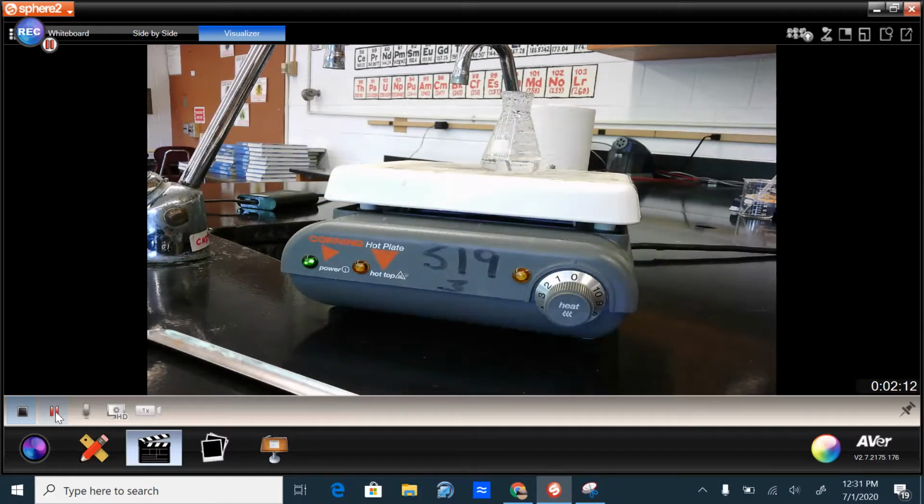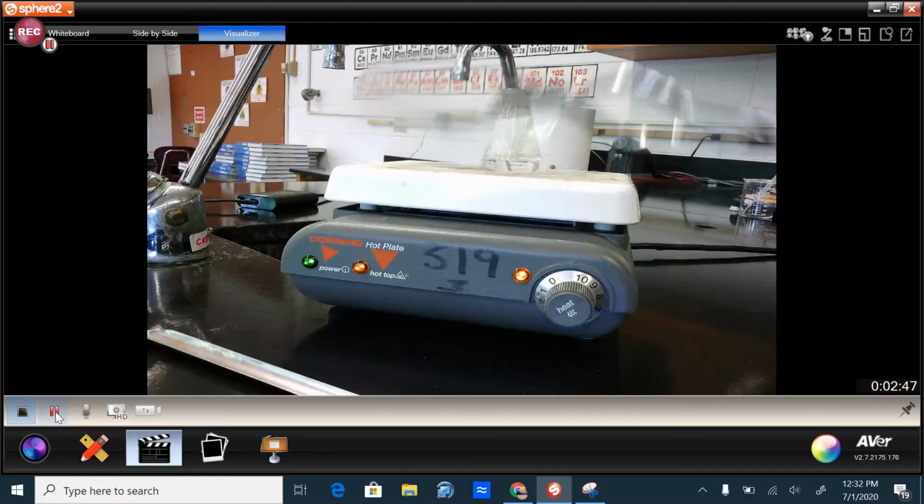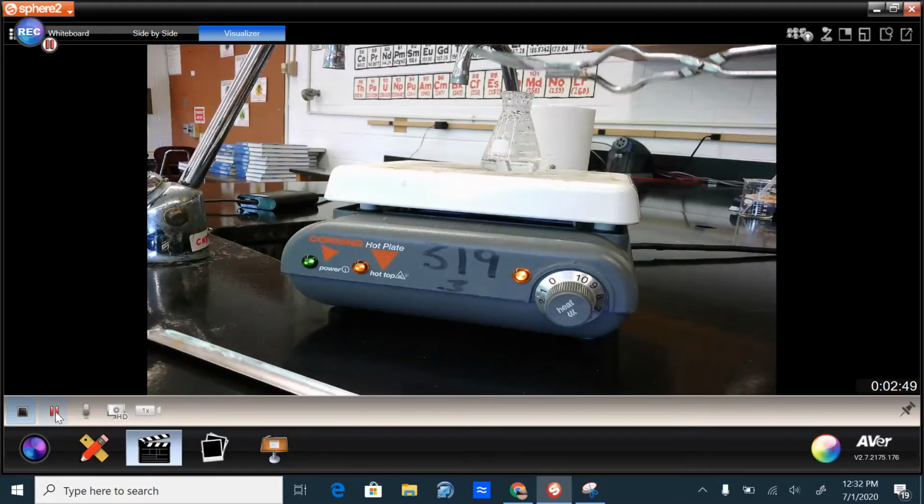For our third process, we have some water in a flask, and we put it onto a hot plate, and we heat that water up. And we're going to boil that water. And we can see that we've got steam coming out of the top of our flask. And then I can take, this is a watch glass, and put that watch glass over the top of my boiling water and make some observations about what happens on that watch glass.